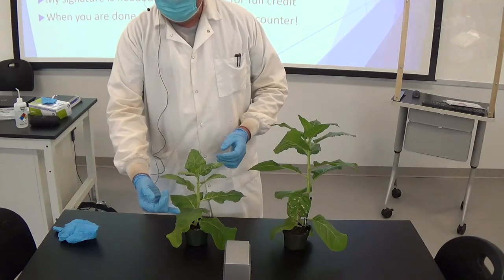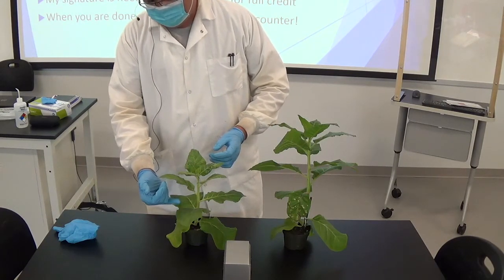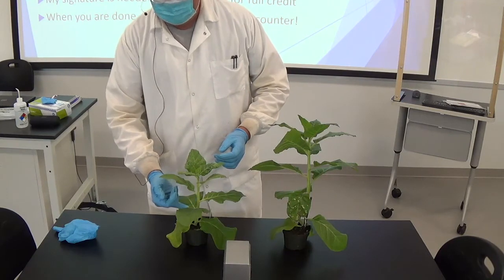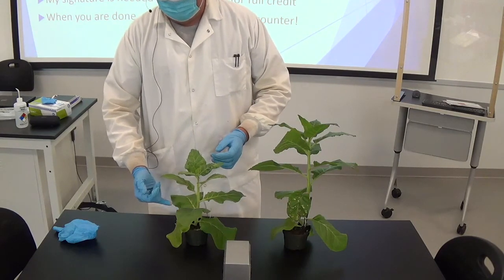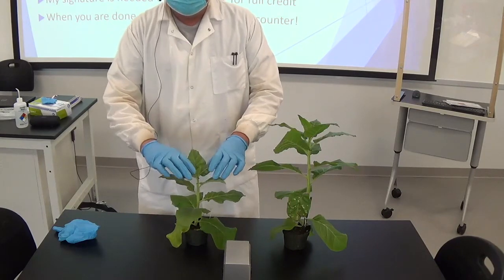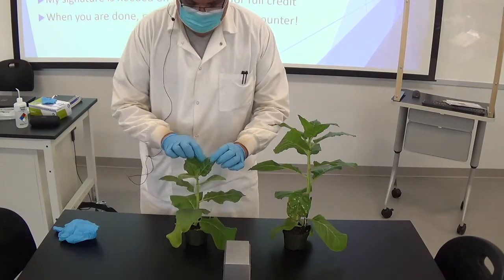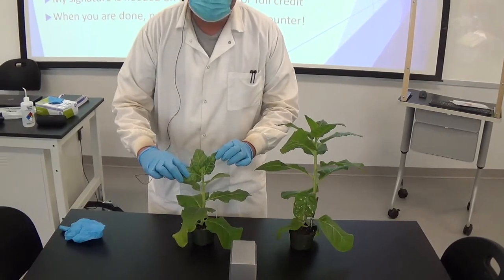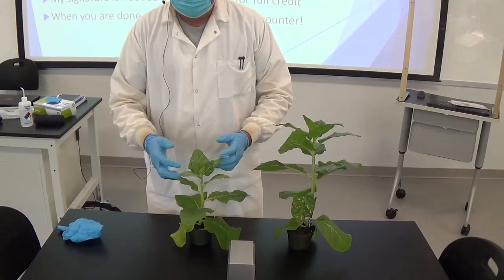So what happens is the virus will actually move through the vascular tissue of the plant. It'll first go down into the roots. I'm not sure why it does that, but then it goes back up through the entire stem to the young leaves growing here at the apical meristem. And you can see they've got really cool symptoms going on. So those are the observations for the TMV inoculation.